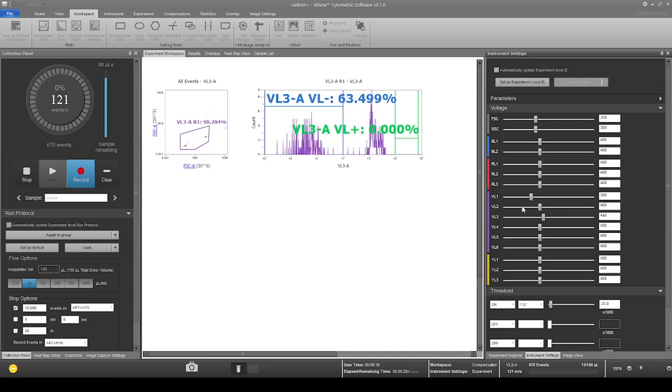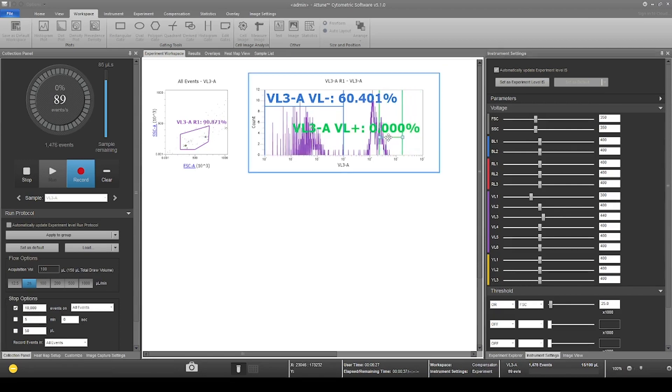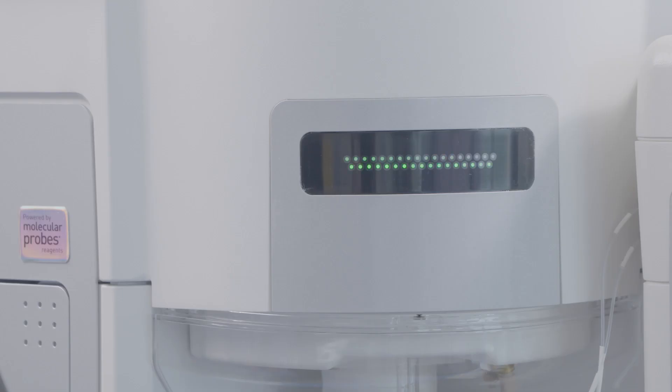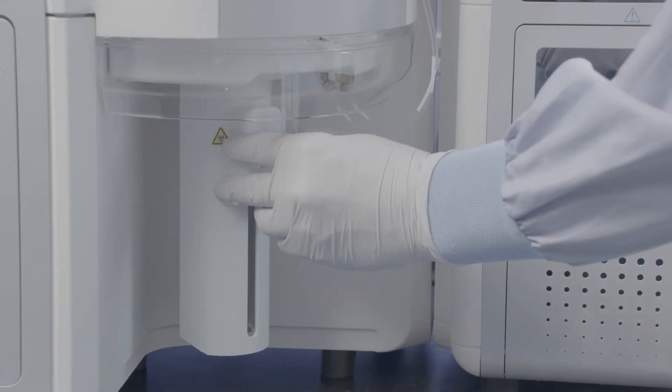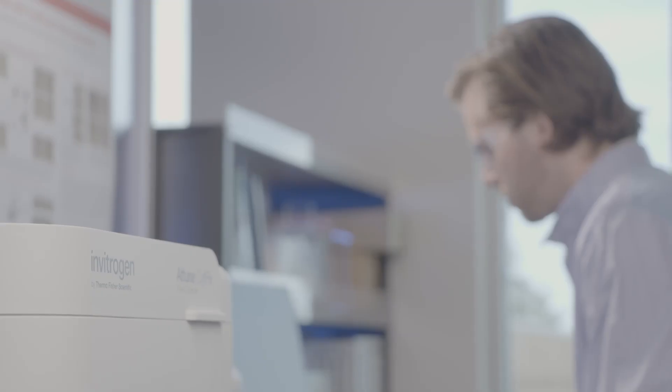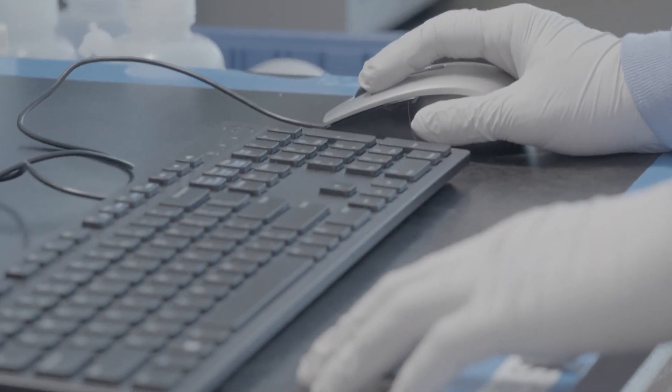When voltages have been adjusted for the final channel, you can save the compensation voltages. Set your acquisition flow protocol and events. Now we're ready to record our first sample channel. After the compensation process is complete, the Attune cytometric software automatically calculates compensation for the user once files are recorded.